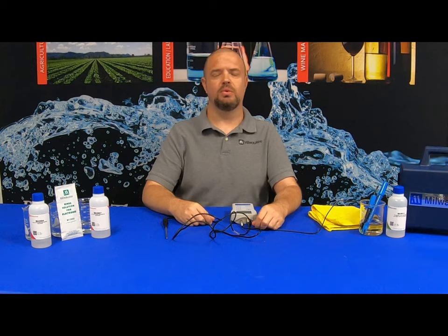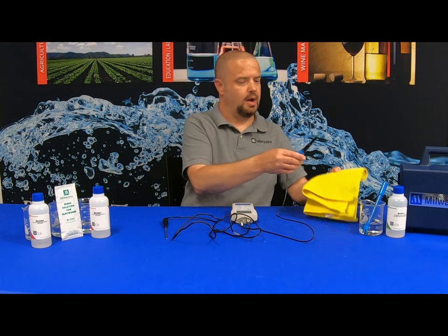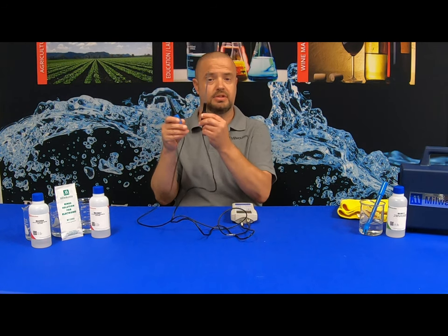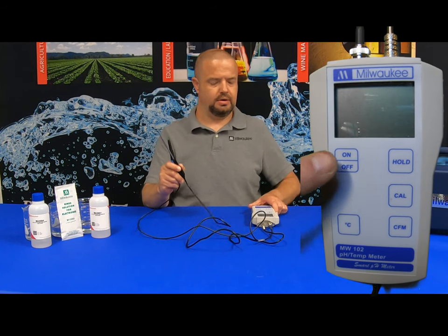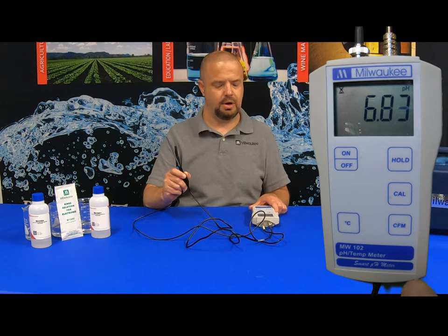We're going to calibrate the Milwaukee Instruments MW102 meter with the MA920B1 pH probe specific for meat and cheese applications. Start by removing the probe from the storage solution and wipe the probe dry. I have already connected the pH probe and the temperature probe to the base unit. To power the unit up, push the on/off button. When we're ready to go into calibration mode, hit the CAL button.